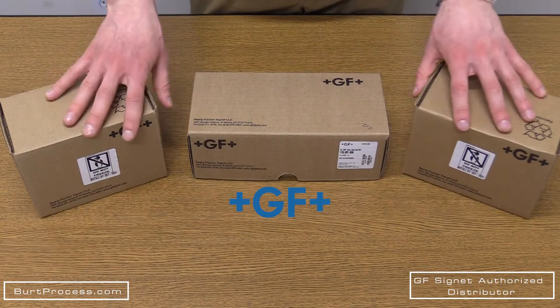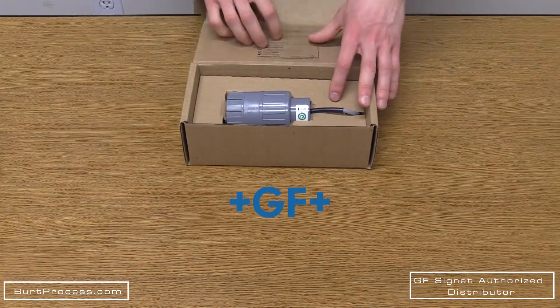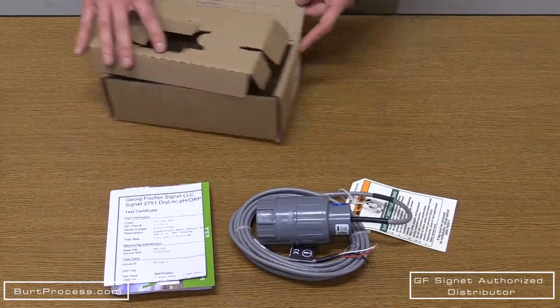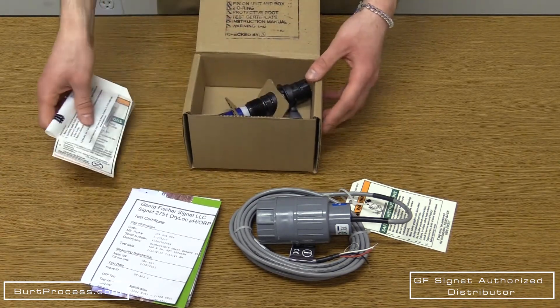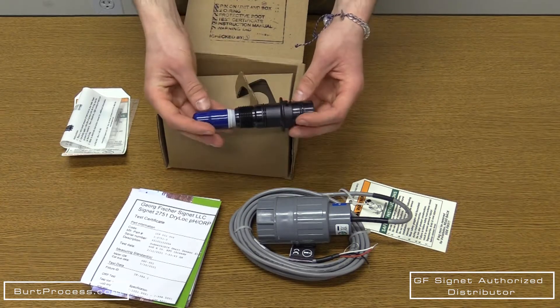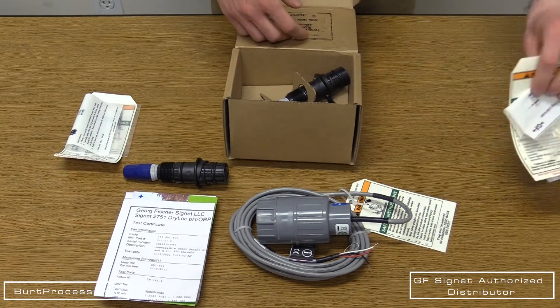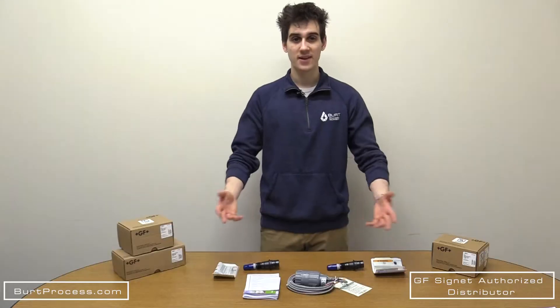George Fisher Signet specializes in automation systems with high performance products in three primary areas: measurement, control, and actuation. George Fisher sensors are made to integrate easily into piping systems. Their control systems use basic relays to PID controllers and the latest communication technologies. As an authorized George Fisher distributor, Burt Process provides our customers with applications and system integration for the complete line of Signet control and measurement instrumentation.